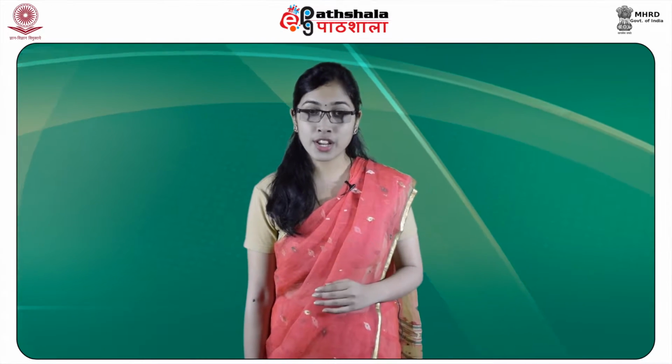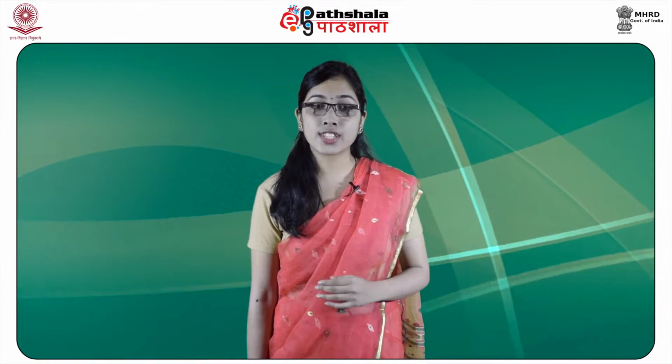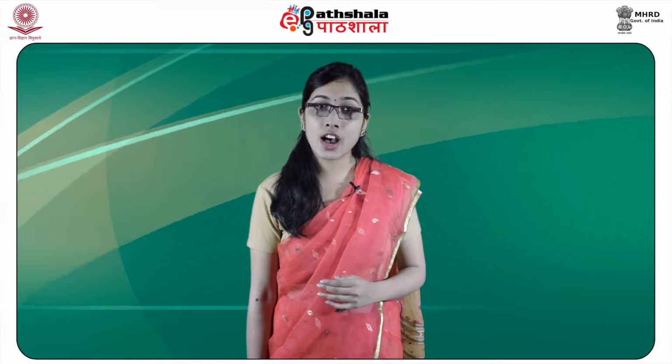Fiber is a rope or a string used as a component of the composite material. It has a highly individualistic character because of its chemical composition, manufacturing process, dimensions, dyes that are examined with the help of TLC, FTIR analysis, optical properties, impurities from the manufacturer, wearer, partial melting, paint smears or other stain, changes in the material due to aging.